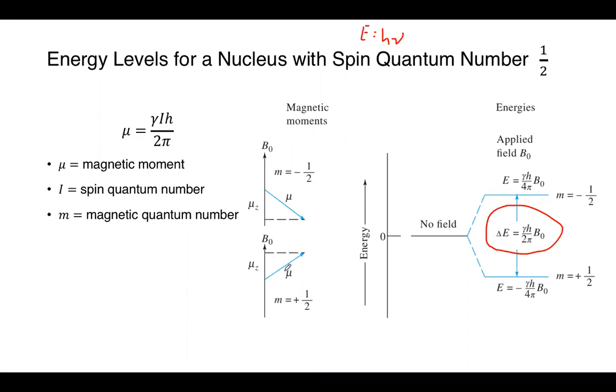Over here, we just have the depiction of the dipole moments mu for spin down and spin up cases. So for spin up, the vector points up, and for spin down, the vector points down. They are identical except that they point in precisely opposite directions.